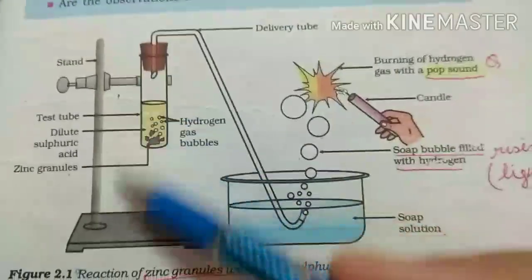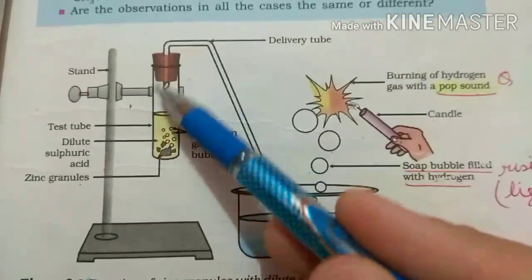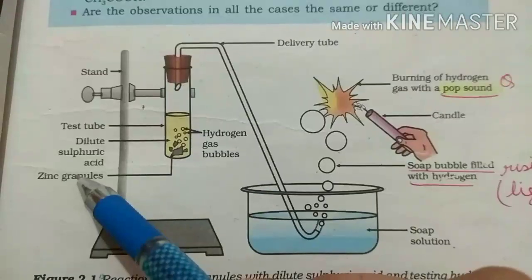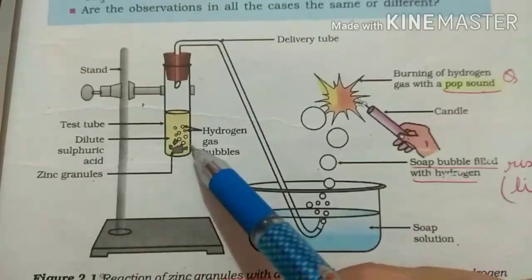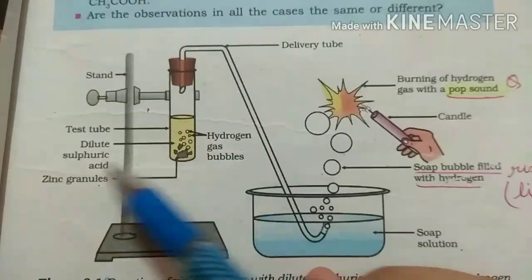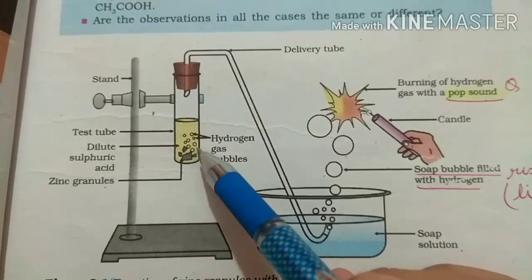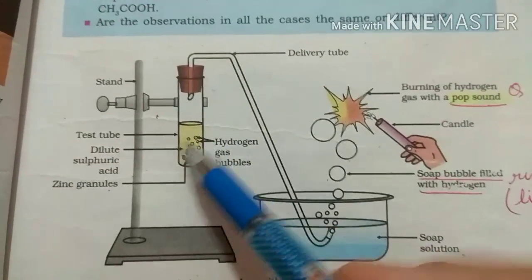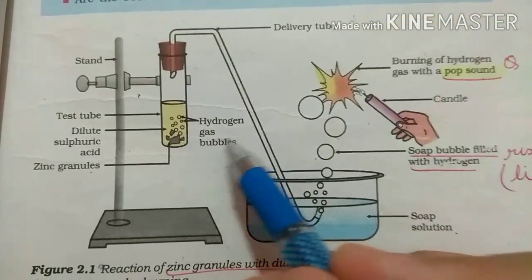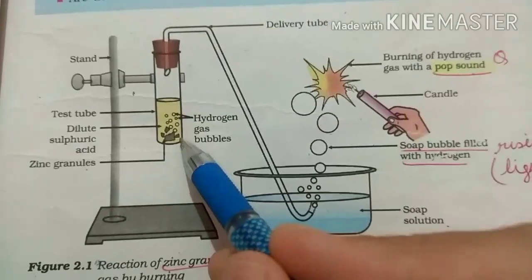Now see, this is a stand. With the help of this stand, we are holding this test tube. In this test tube, we have zinc granules. These small grey colored pieces are zinc granules. Then we add dilute sulfuric acid to these granules. Okay. Then what will we observe? We will observe gas bubbles around zinc granules.